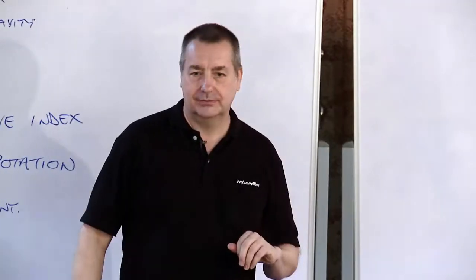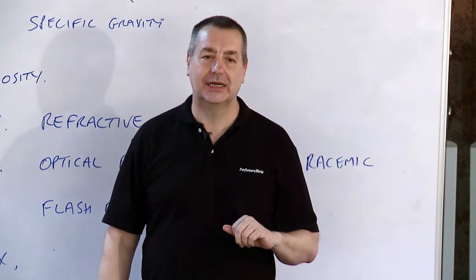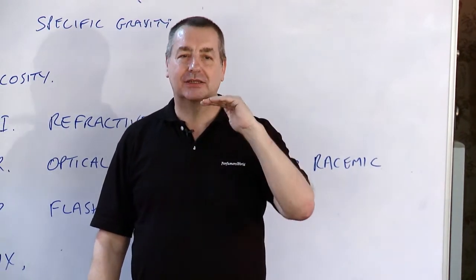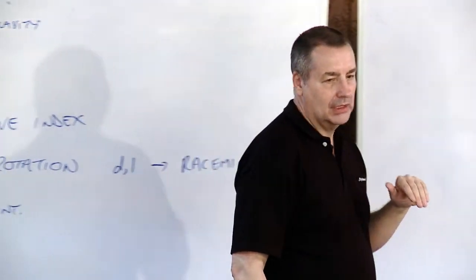I can never remember which way. Till it changes, yeah. Using alkali, you need to watch when the red starts changing to blue. So you're looking for that point when it's not blue and it's not red, yeah. And that tells you how much free acid there is in the product. Phenolphthalein, yeah.